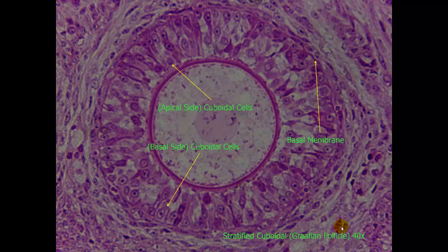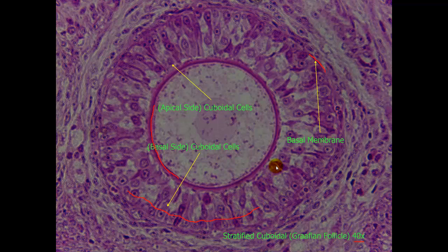Here is a 40x objective view. We can see the basal membrane on this side, and we can see the apical side here. Here is your first layer of cuboidal cells, and here is your second layer of cuboidal cells. One trick when trying to identify these is to use the focus adjustment and ever so slightly adjust it up and down so that you can help to see the cell membranes between the cells themselves, and that will help you to identify them as cuboidal cells.